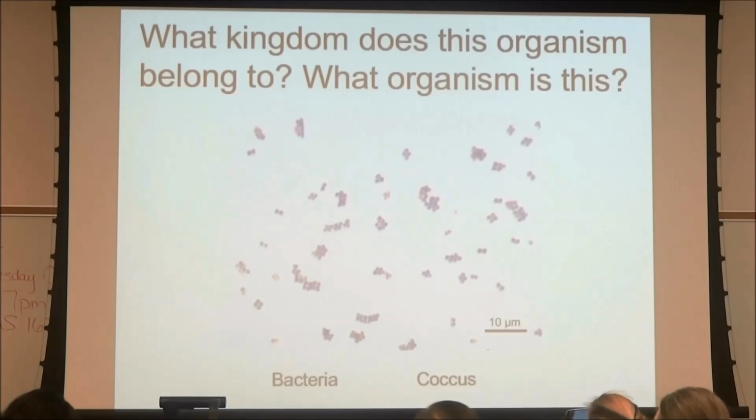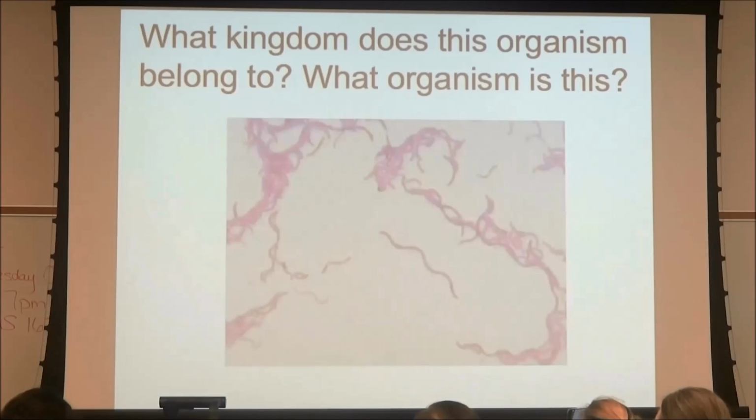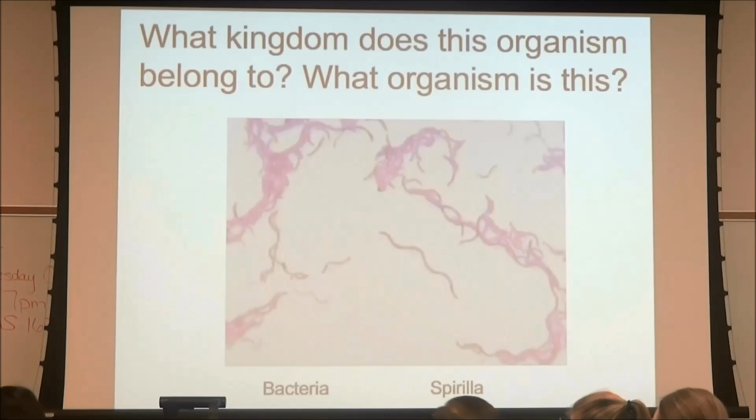Are you guys all right if I switch? Okay. What is this? Spirilla. Good. It is spirilla. And how did we know it was spirilla? Yeah, because it's wavy, right? Spirally shaped. And it's pretty small. Yeah, this is spirilla. You guys can take your pictures.